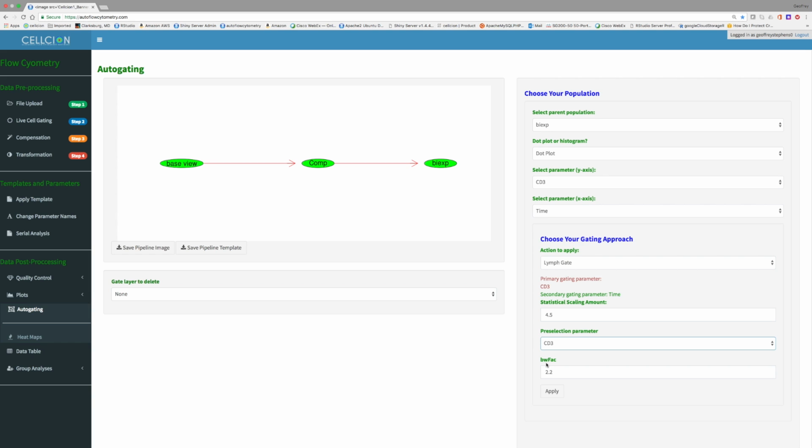The BW factor allows us a bit more fine granularity, which again I'll speak to more in some of the subsequent tutorials. But once you hit the apply button, you'll give the computer a second. You see the progress bar down below is letting you know that the program's not crashed, that you're just waiting on things to progress. And everything's going to update here very shortly.